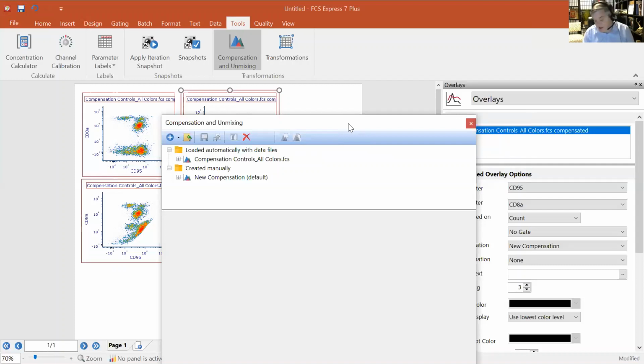So I think in that case, you're essentially setting up two different compensation matrices. And what you would probably want to do, I imagine, is have a set of single stain controls for each one, and some of them would overlap and some of them wouldn't. Essentially, you'd create a layout and do an automatic compensation for, say, tissue 1, stromal cells or something like that. And then you'd create another compensation and a separate layout for tissue 2, tumor cells, or whatever it is.